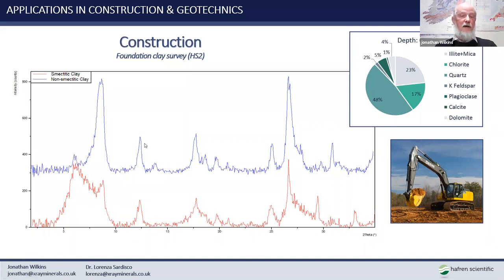The upper trace similarly has exactly the same kind of shaped peaks here for kaolinite and or chlorite, but you can see that generally it is rather sharper and better formed. And this peak, critically, is very sharp. So that is an example of an illite which has no smectite interlayering. So it is neither a mixed layer illite smectite, nor is there significant smectite present in that area.